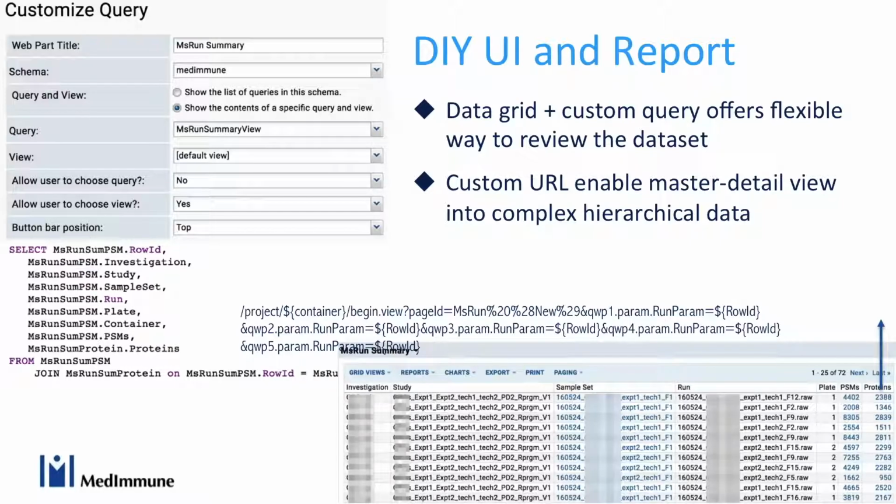Most of the time, we'll write a query ourselves, and that becomes the customized query when you look at the listing. It's just an ordinary query with a little bit of LabKey requirements, mostly to do with container scoping and how user access control is applied. But this is really nothing more than just a SQL query. You write it, and the query will produce a data table, such as the one listed here.